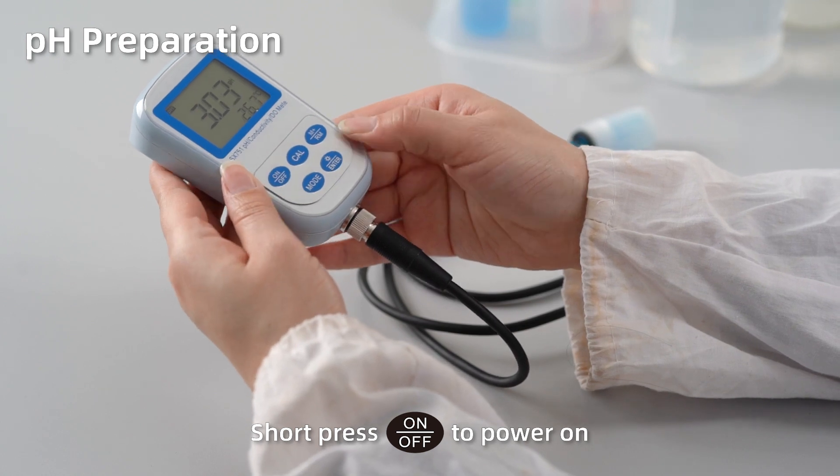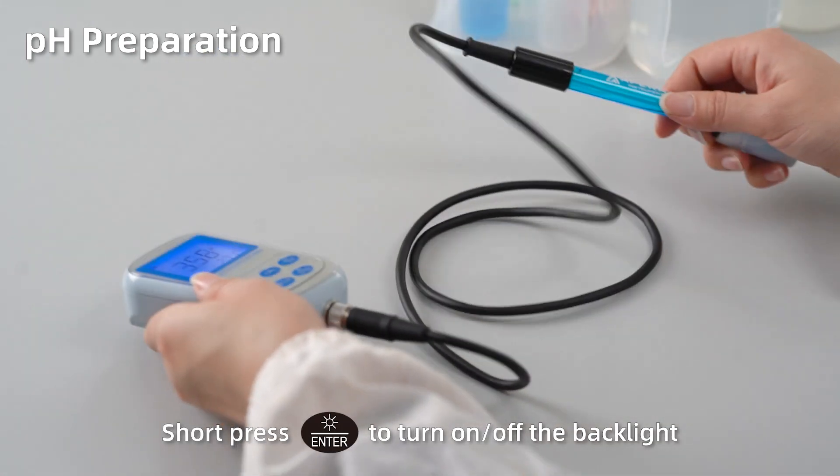Short press On to power on. Short press Enter to turn on or turn off the backlight.